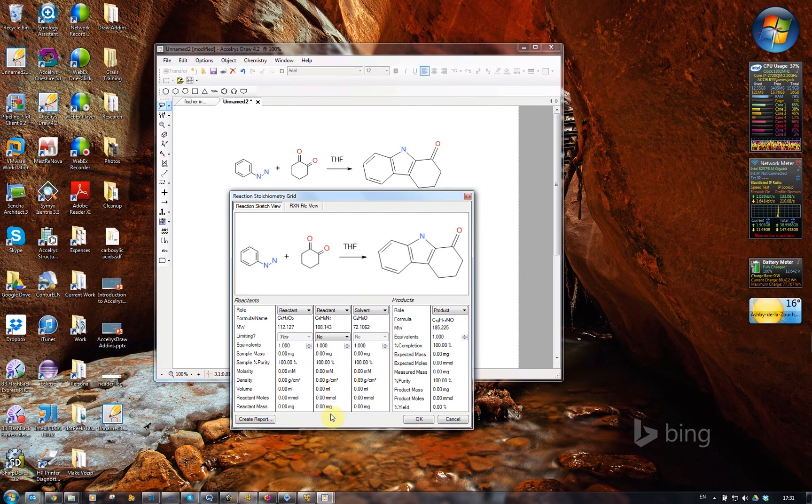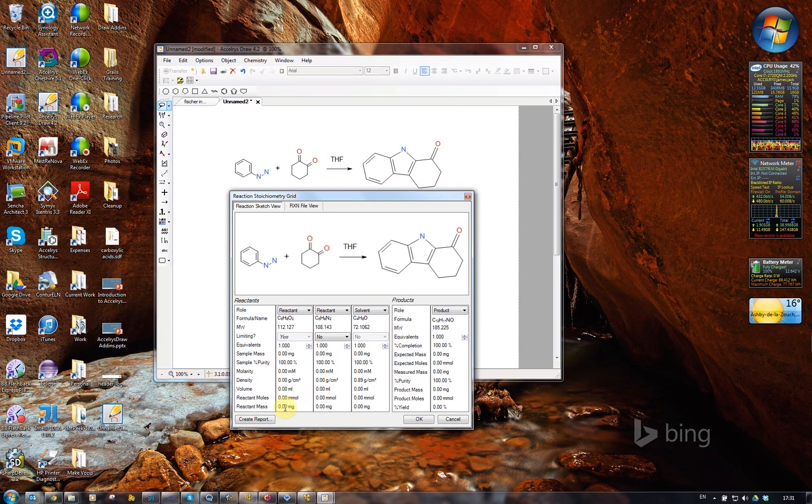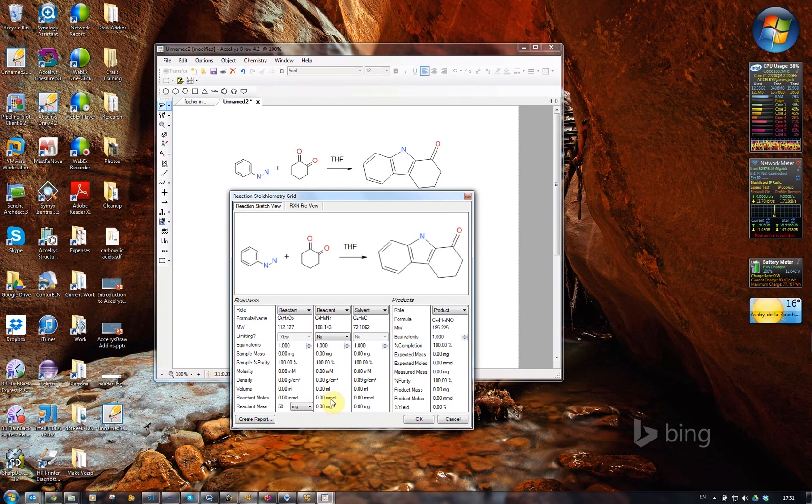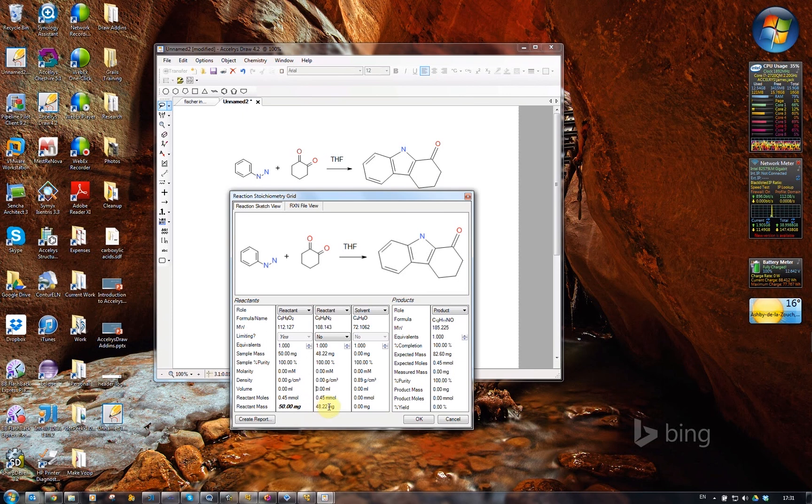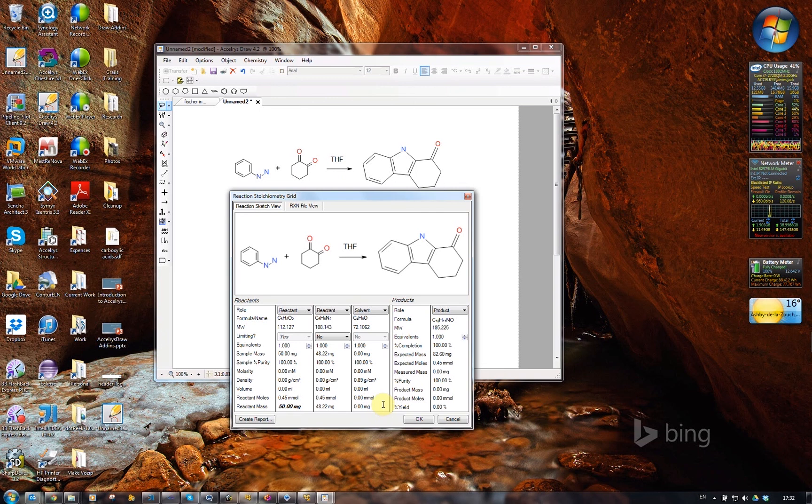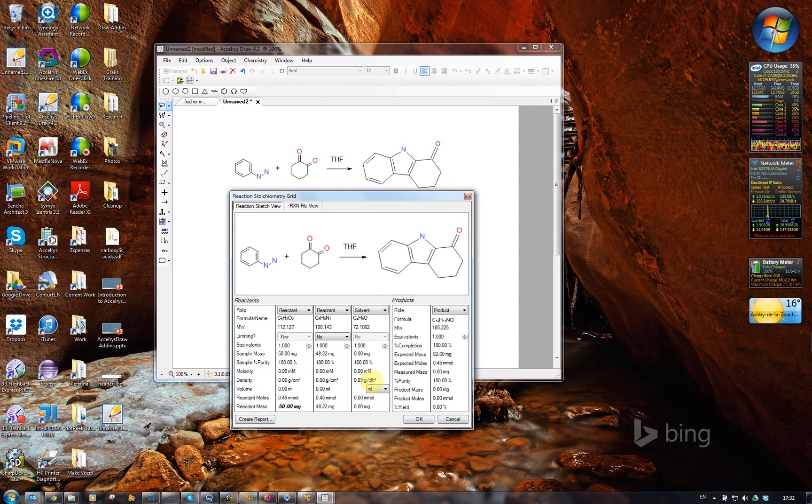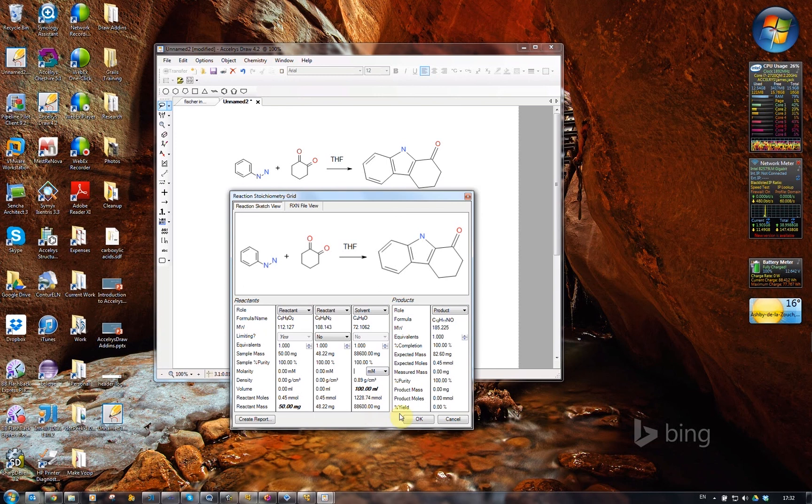What I can begin to do now is say that we're going to start off with, say, 50 milligrams of that material, and it works out that we'll need 48.22 milligrams of this material. And then if we say we're going to use 100 milliliters of THF, it works out how many moles and so forth that is.